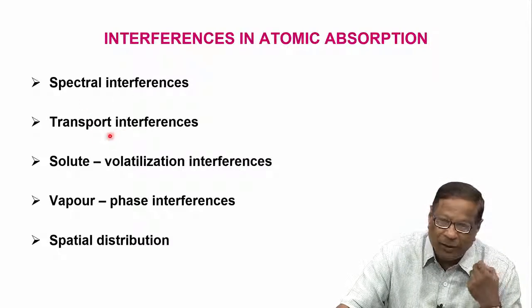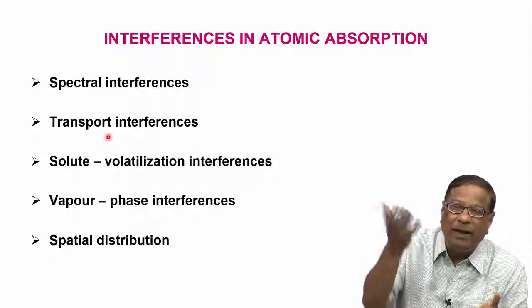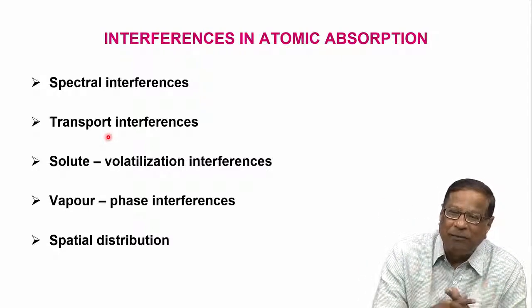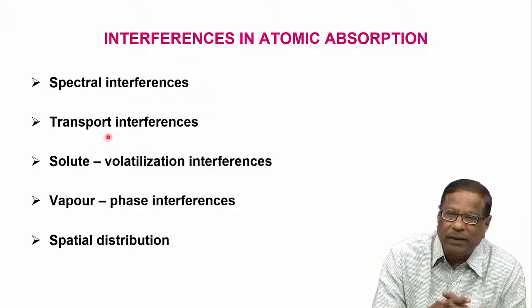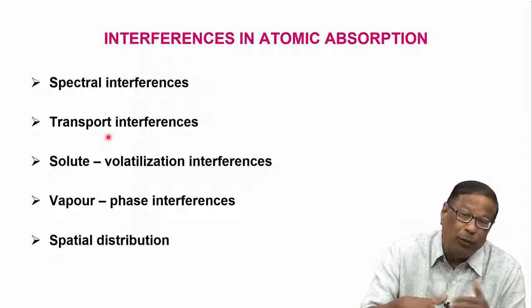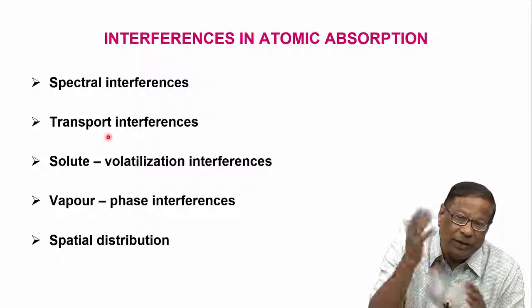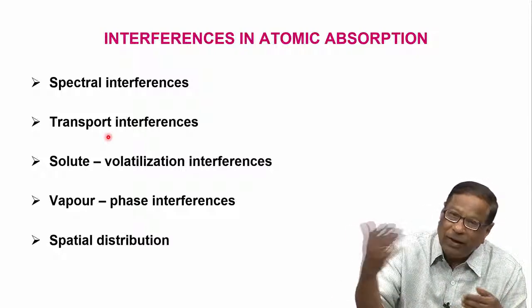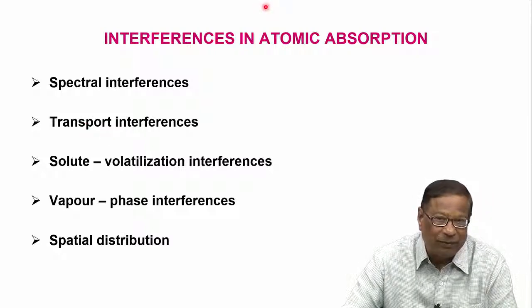Then transport interference: suppose the sample is not getting introduced into the flame properly, the number of free atoms will reduce, so the absorbance will reduce. Suppose more quantity of the sample is being aspirated, more free atoms, that also can give rise to higher absorbance.